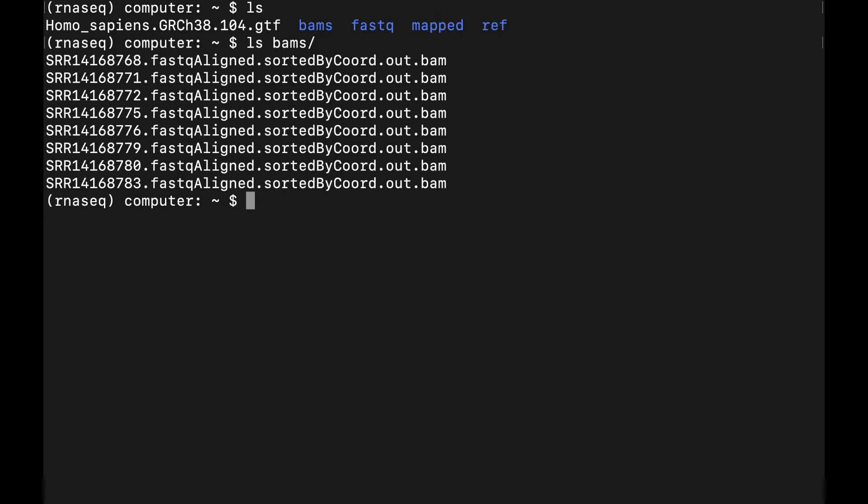So feature counts is actually part of the subread conda package, so we'll just install this.